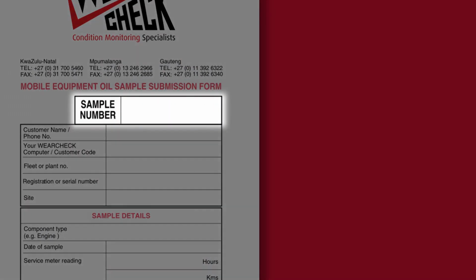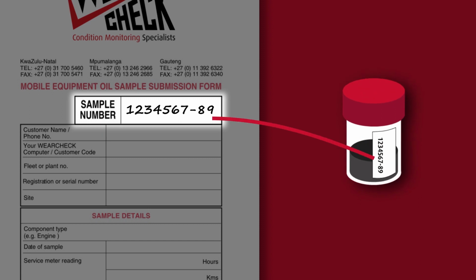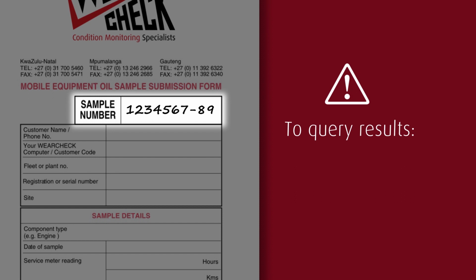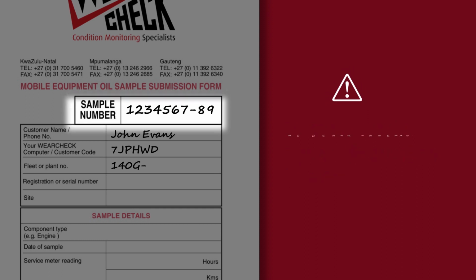The sample number is a unique ID for the sample. Ensure that the numbers on the subform and on the bottle are the same. If you need to query results, make sure you have this number handy. Finding results can be almost impossible without the sample number.